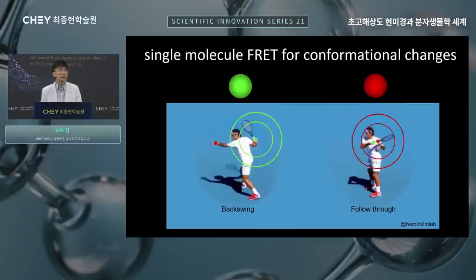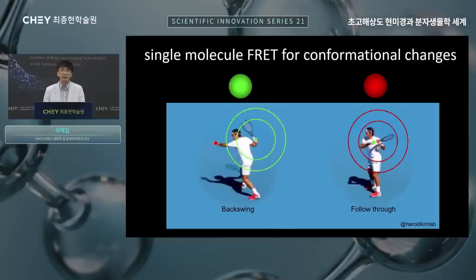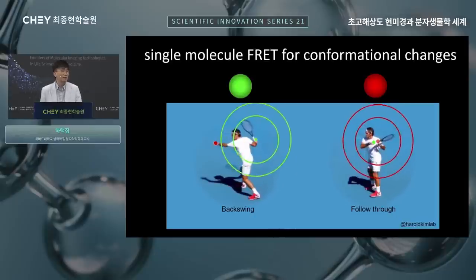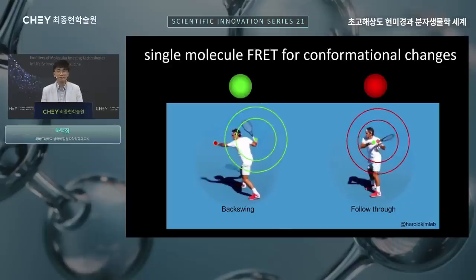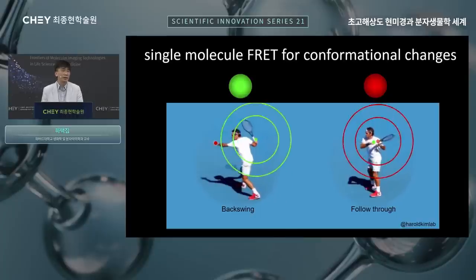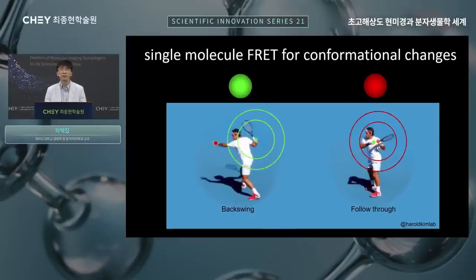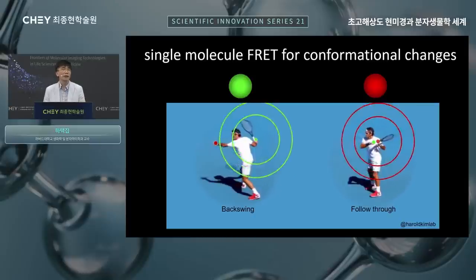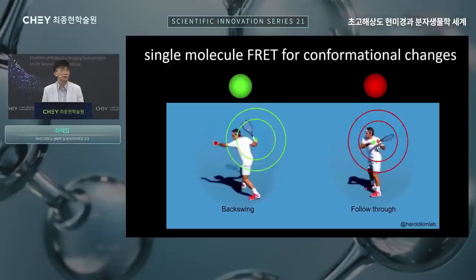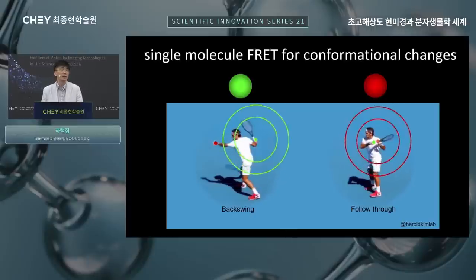Imagine having a protein with two major conformations shown here. On the left, if you put two dyes, green and red, on the protein at two locations, when they are far away from each other in one conformation, then exciting the green dye will give you green emission. But in the other conformation, the dyes are close to each other, so exciting the green dye will result in transfer of the excitation energy from the green to the red molecule, and you get red signal coming from the molecule. So even when you cannot see the details of the protein structure because of the resolution of optical microscopy we learned about from Dr. Moerner's talk, we can just look at the color, whether it's green or red or in between, to deduce what's going on. So that's the concept for this technology.